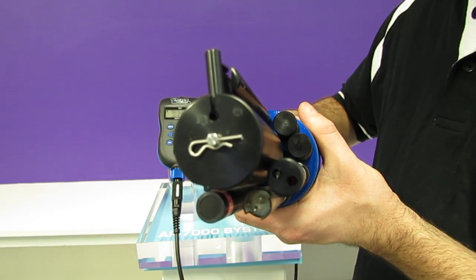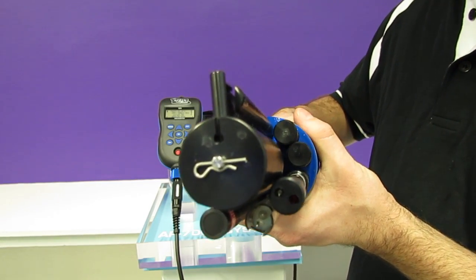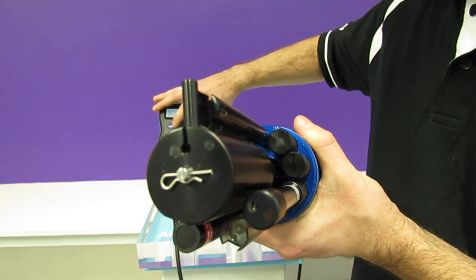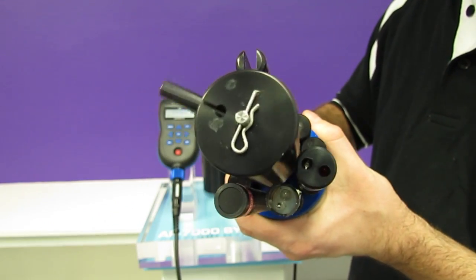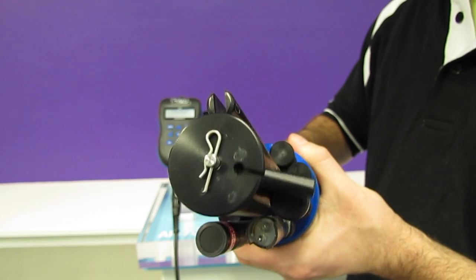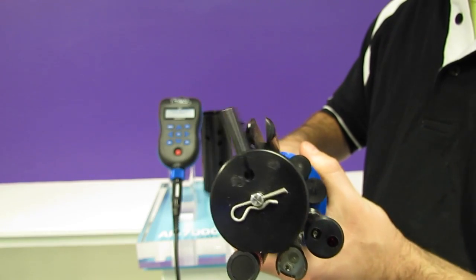The AP7000 is designed for long-term deployment. As such, it has a central self-cleaning system. If I initiate the self-cleaning system, we will see that the arm goes around and cleans each of the installed sensors multiple times, ensuring that they are kept clean for longer.